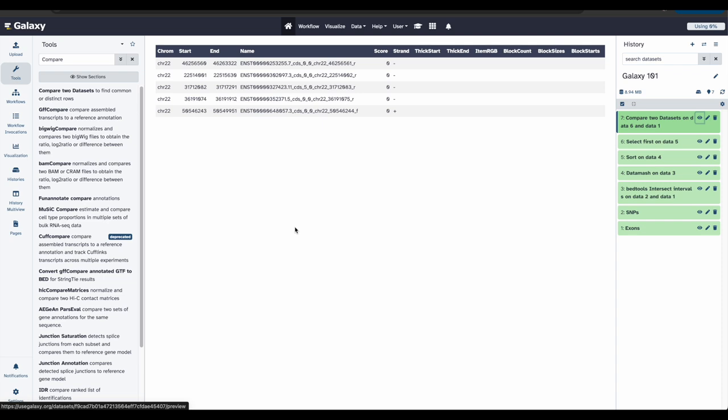So a good way to learn about these exons is to look at their genomic surroundings. This can be done by using genome browsers. Galaxy can connect to online genome browsers like the UCSC genome browser.